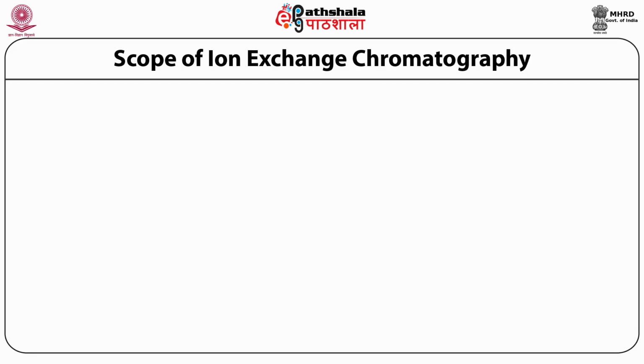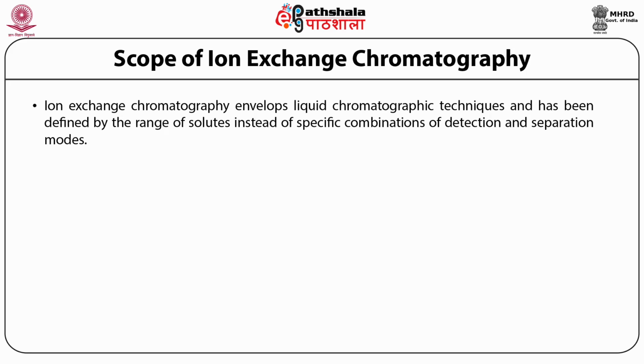Scope of ion exchange chromatography. Ion exchange chromatography encompasses liquid chromatographic techniques and has been defined by the range of solutes instead of specific combinations of detection and separation modes. It is devised explicitly for the separation of differently charged compounds between stationary and mobile phases.